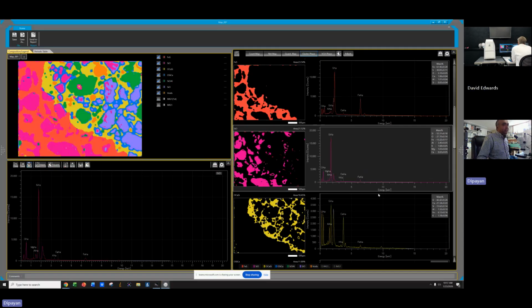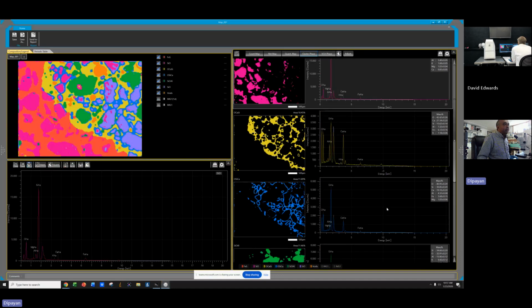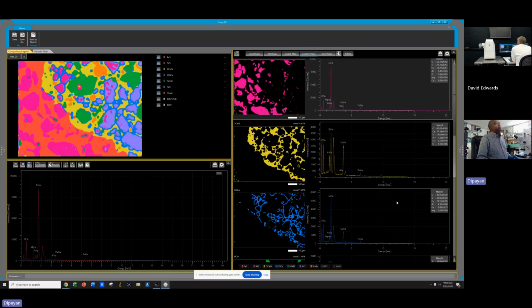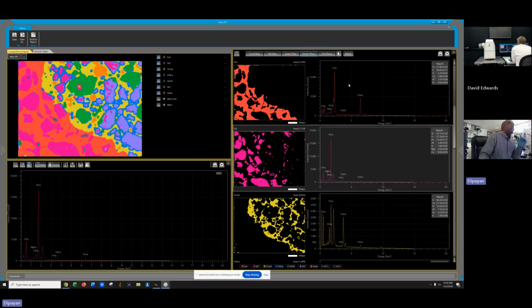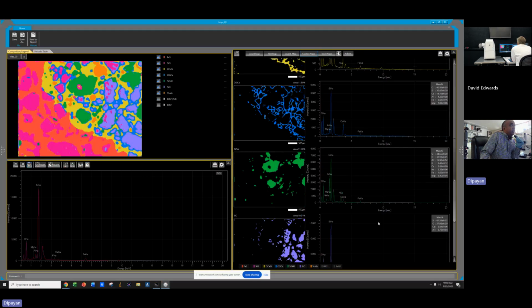Bill said the second version is coming end of February. I'm looking forward to phase analysis version 2. But this one really does the job. I play with the adjust button and do everything. But let me ask you an important question now, because I've been doing it this way. How can I build my own library?